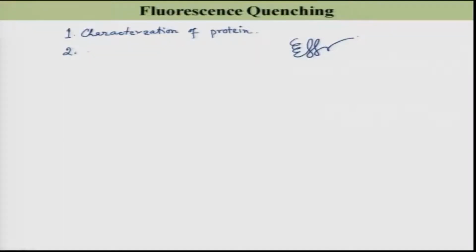Okay. Number 2, you can also study protein conformational change by the fluorescence quenching method.